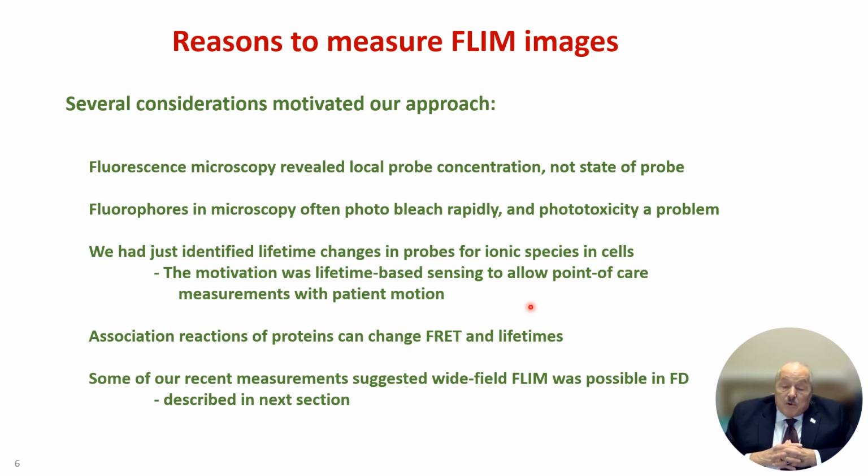So we knew that many of the ion-sensitive fluorophores had lifetime changes, and they could be used for FLIM. So we had some recent observations that suggested to us that frequency domain FLIM would be possible.